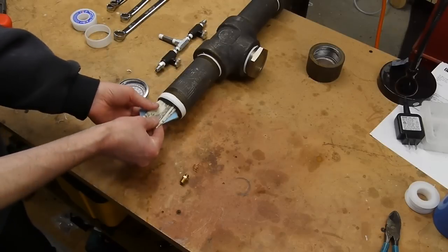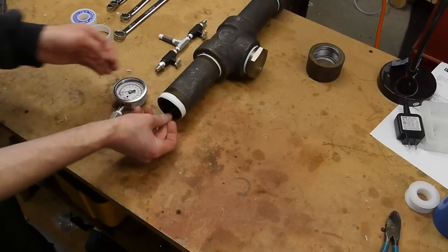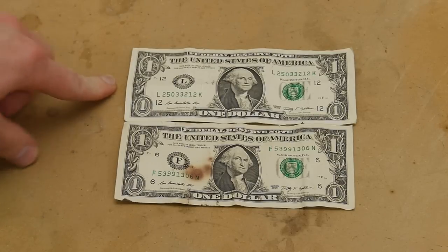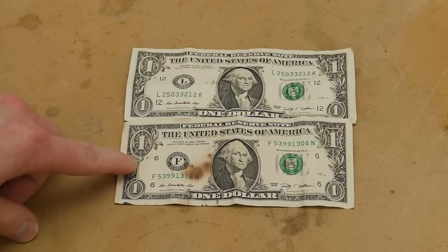I also put a dollar bill into the ammonia chamber, thinking that the fibers in the dollar bill would also allow it to change shape. And as you can see, here are the results. This top bill just came out of my wallet, and this was the bill that went through the dry anhydrous ammonia chamber.